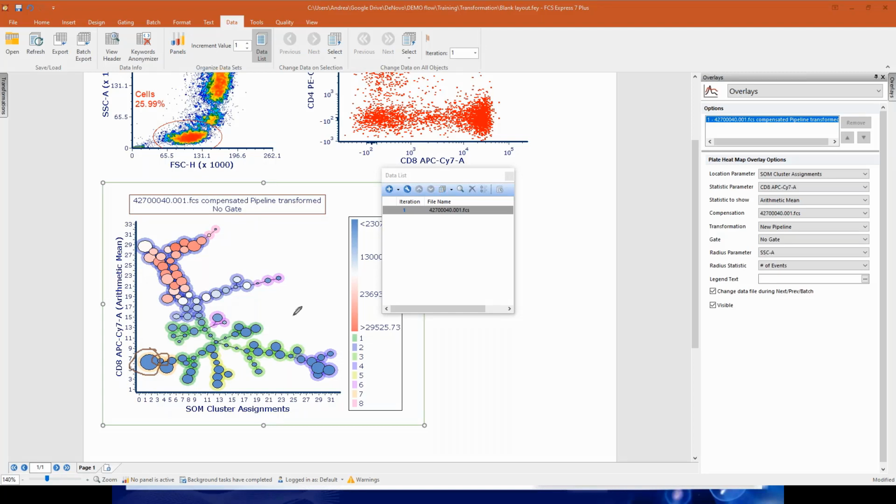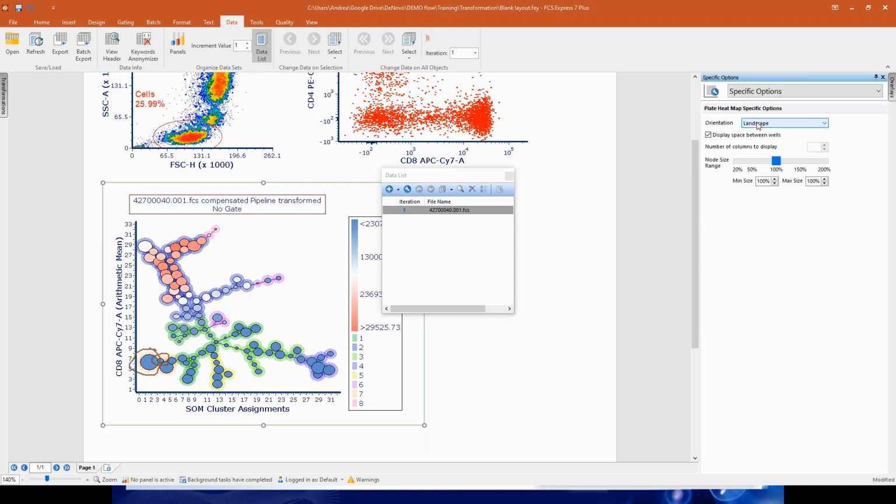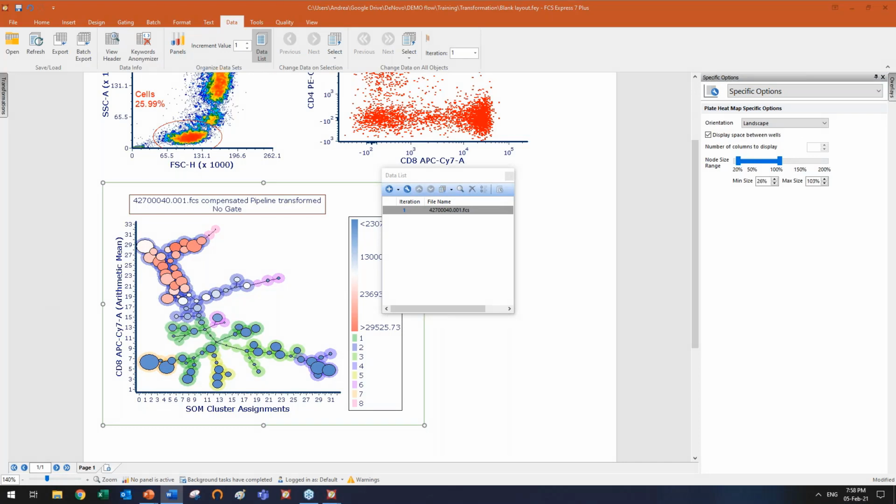You can also shape these nodes a little bit, using the resize option. You can make the small nodes smaller, and you can make the big nodes larger, or anyway change them at your convenience to make a nice representation.